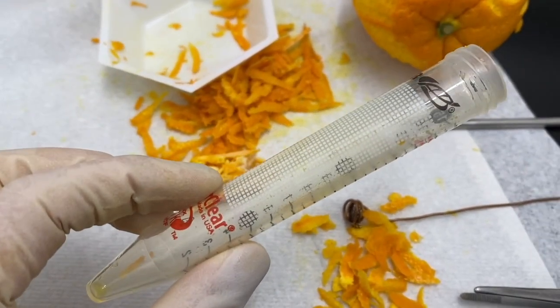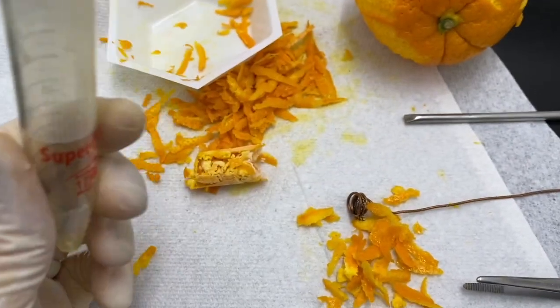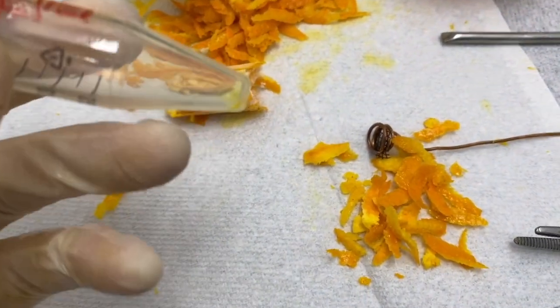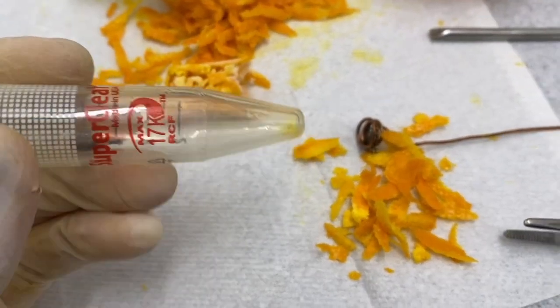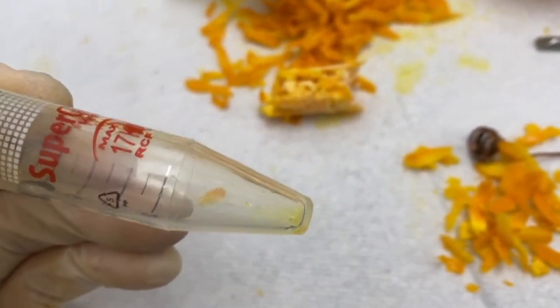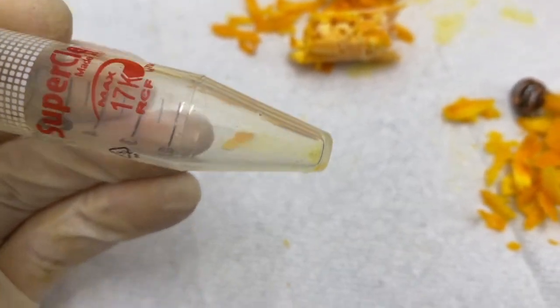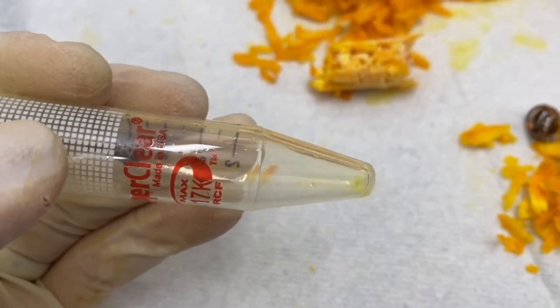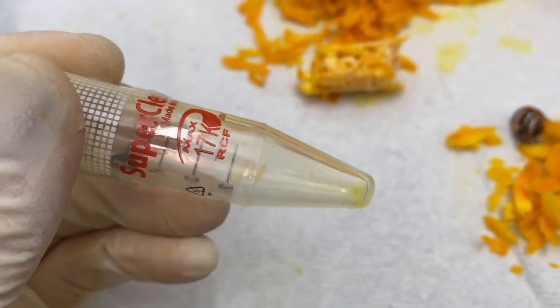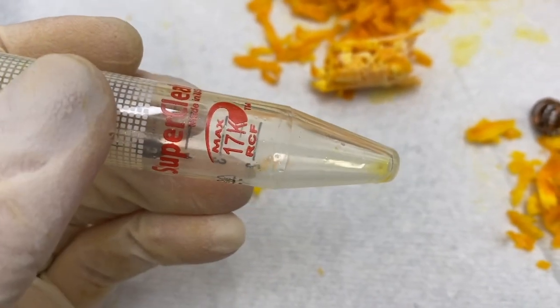Now that we've done those three extractions, I was able to pull out all of that orange rind and very carefully took out that piece that settled to the bottom. Now you see we have just that little oil sitting at the bottom of our tube, which we'll get a mass of so we can get a mass by difference to get our mass of the oil only.